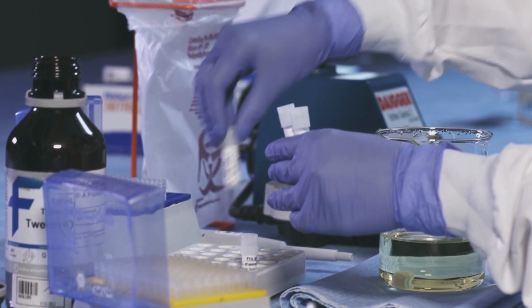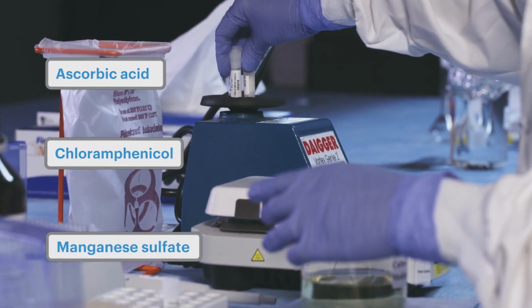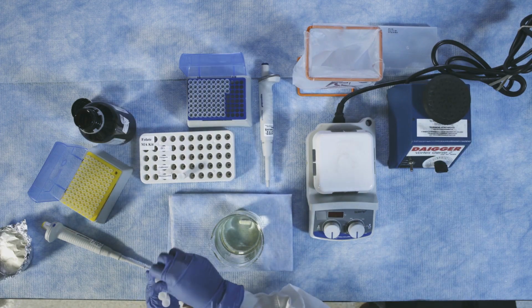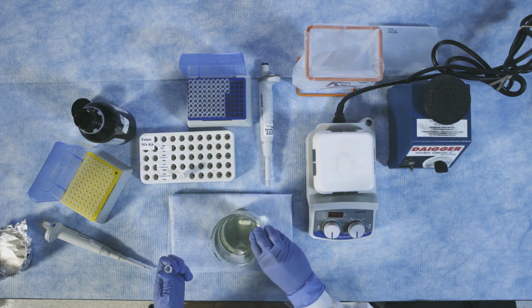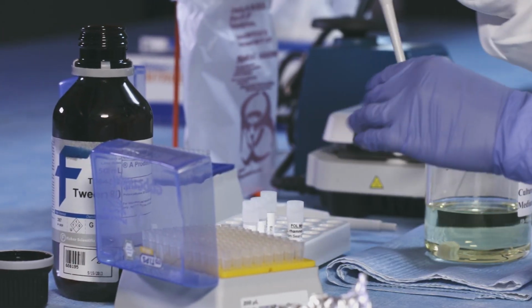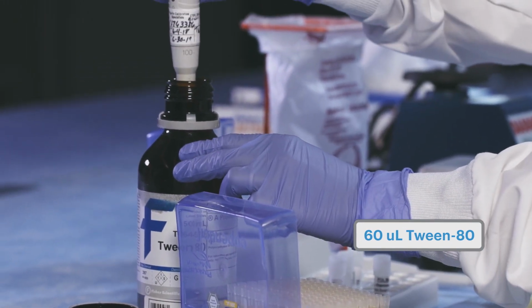Add 1 vial each of ascorbic acid, chloramphenicol, and manganese sulfate solution. Add 60 microliters of tween 80.